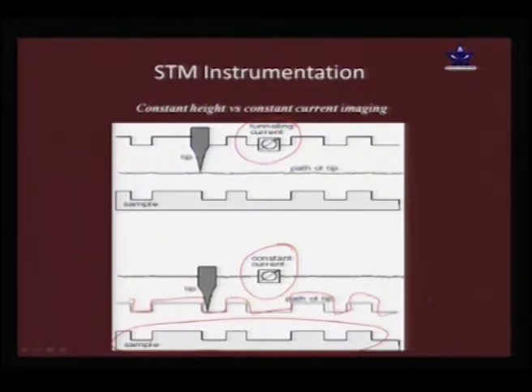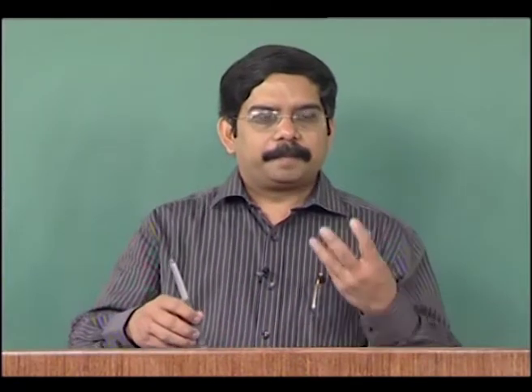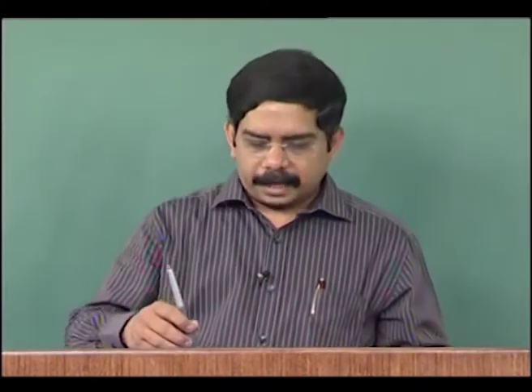and will exactly map the path of your atomic surface. So, both are predominant, and sometimes it is advisable to have a constant tunneling current, and then you let it go through different heights. If your sample is dirty and not very smooth, then in this approach sometimes your tip can pick up some dirt or some islands of atoms, which will become very difficult to remove.